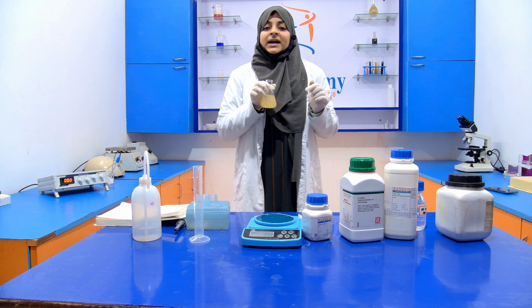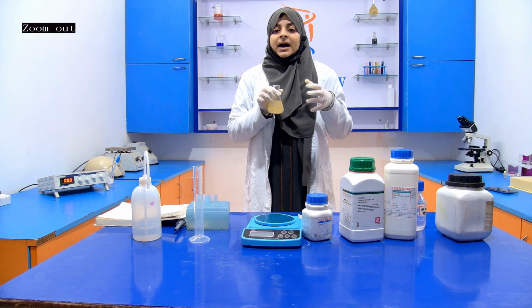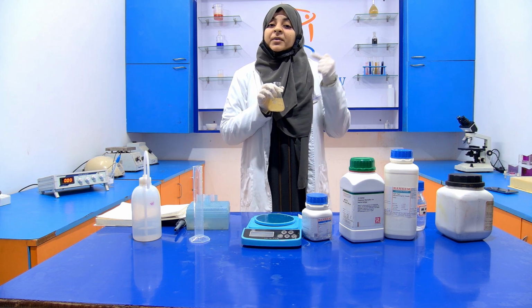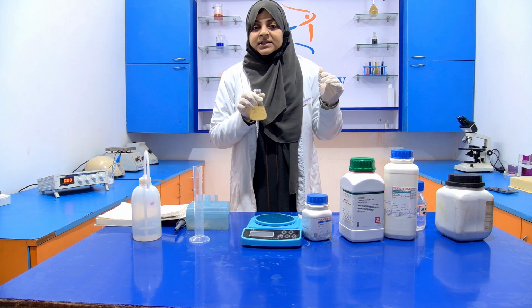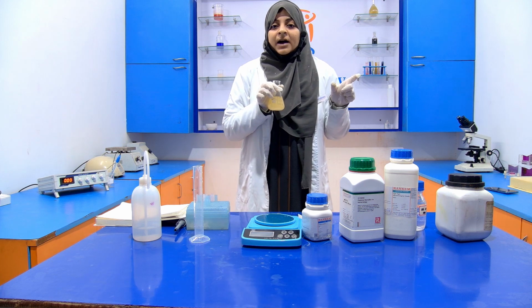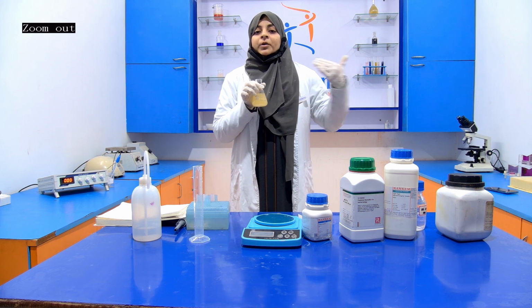If we are not adjusting its pH, maybe the agar will not solidify. So maintain the pH before sterilization; you don't maintain the pH after sterilization because it will create a contamination. You have to maintain its pH before autoclaving.